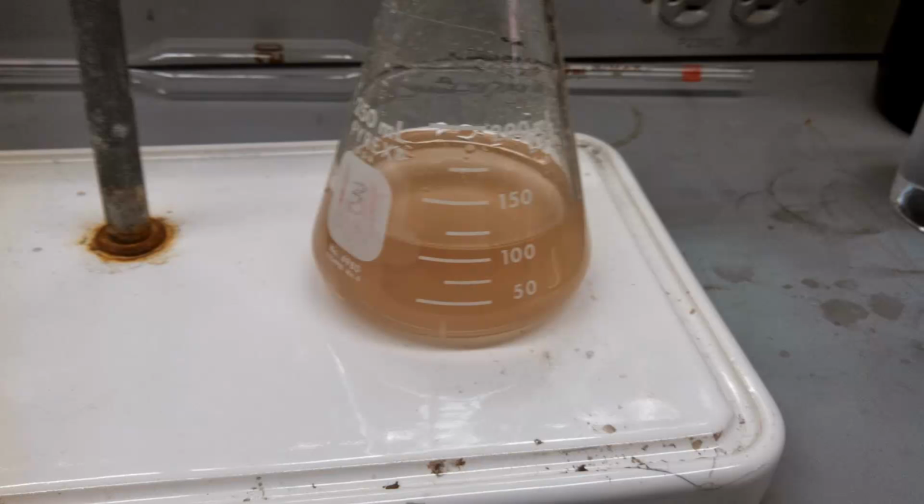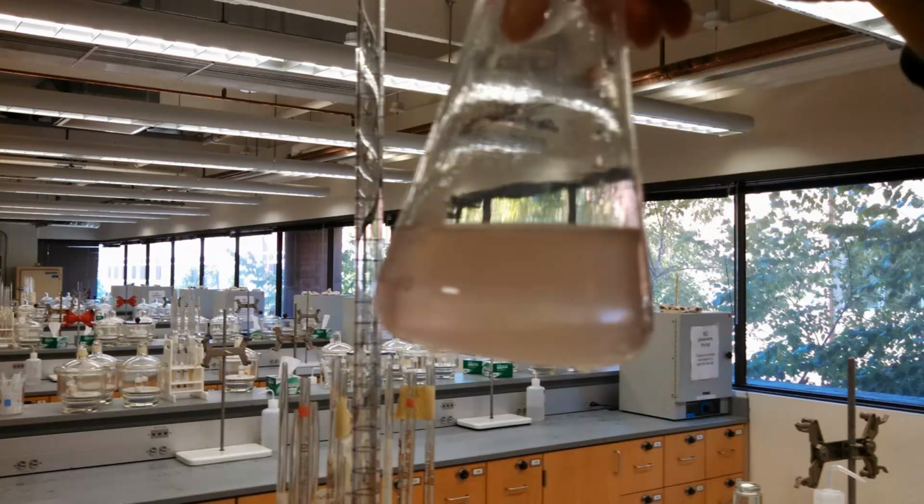Now the flask will be cloudy because of the starch, and it may be not totally colorless, but what you're looking for is the disappearance of that blue complex color. Here's another look at it.